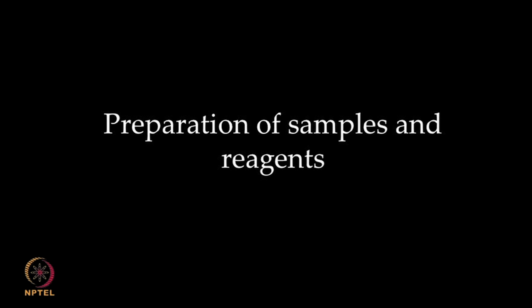We will now work on the reagents required for the screening assay for binding of the proteins, human serum albumin and carbonic anhydrase, against several small drug molecules.